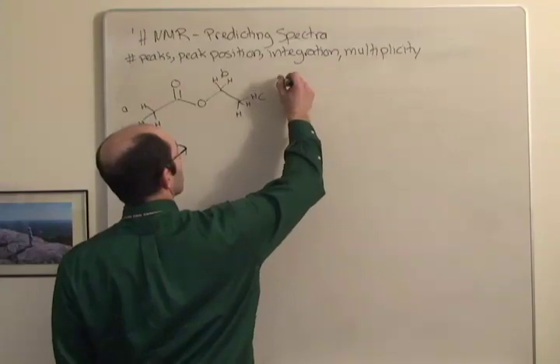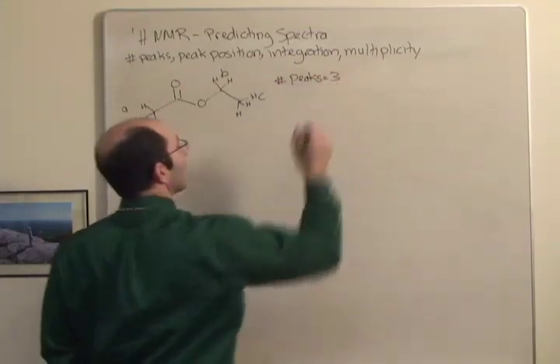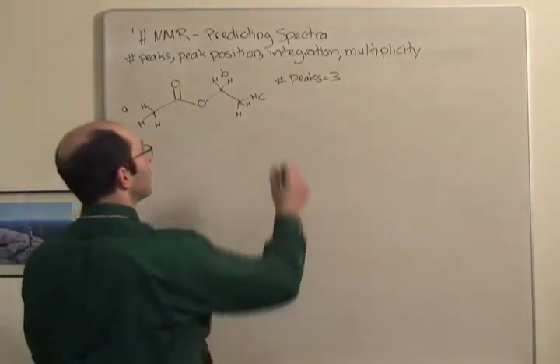All right, so number of peaks, we're going to predict 3 peaks. Right?